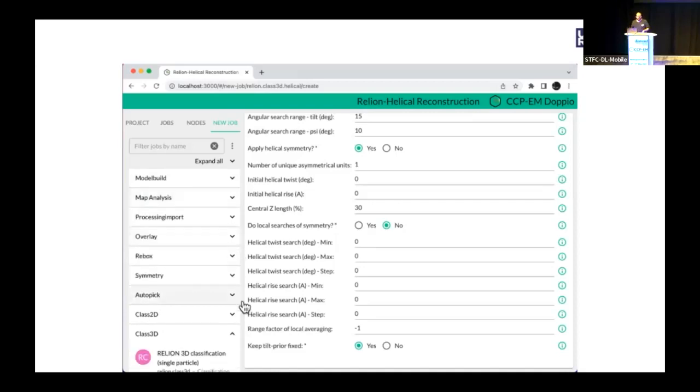So there are lots of ideas of how we want to use this skin system. A facilities manager could decide you have a specific set of supported software at your facility, so you have a skin that only gives access to those pieces of software. If you're going to teach beginners or run tutorials, you could again have a skin that has just the software they need, all in sequential order, ready to go. And if you have a project where you have a really defined workflow, you could actually make a skin for just that project, having again all the jobs you need in sequential order and no extra stuff to worry about.